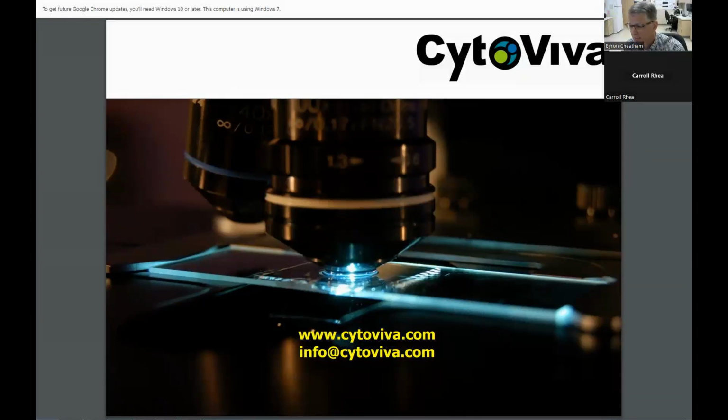Now, once it's inside a mammalian cell, most typically the endosomes are looking to try to scavenge and clean that up. But I do know that we have had researchers, Dr. Devika Chithrani at the University of Victoria comes to mind, where she created very small nanoparticles in about the 12 nanometer range. And she had a targeting protein that allowed those nanoparticles to cross the nuclear membrane, which is quite a feat. But she's published numerous papers demonstrating that.